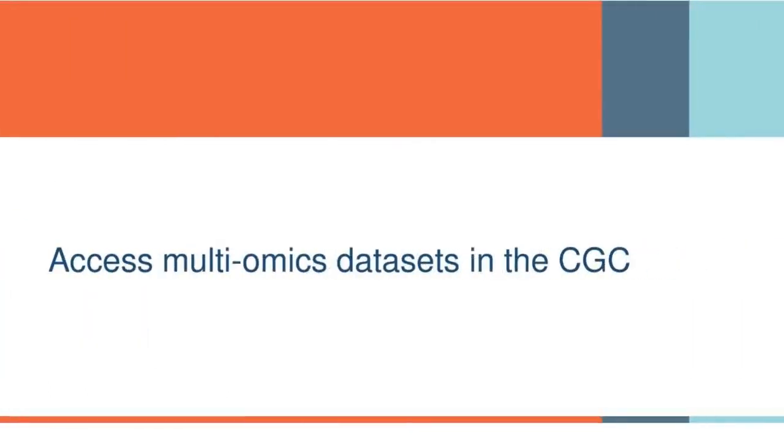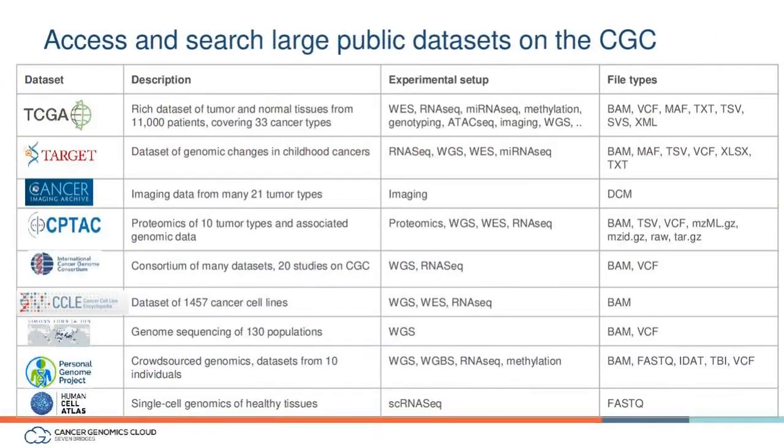I'm going to be introducing multi-omics data sets in the CGC in my next section. You can search and access several large public data sets on the CGC.